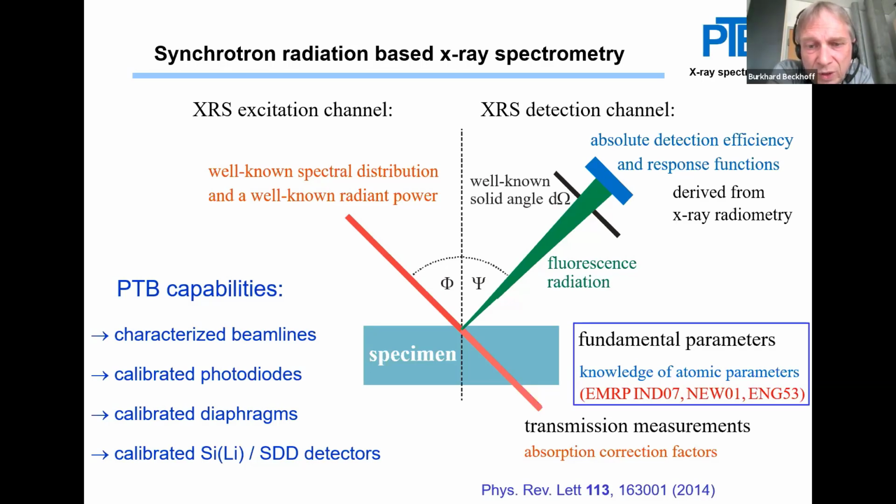And in addition, we can determine X-ray fundamental parameters by means of transmittance measurements. These are the data that you need to use, for example, in an XRF quantification using the Sherman equation.